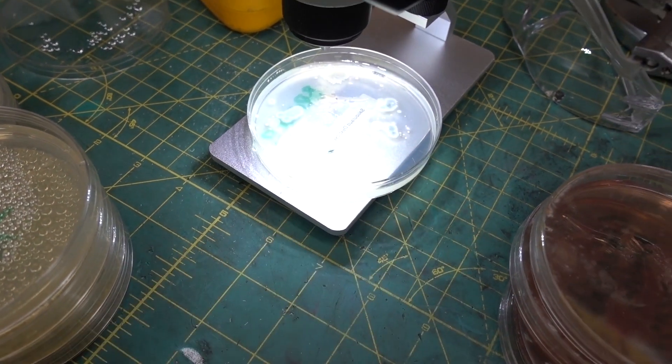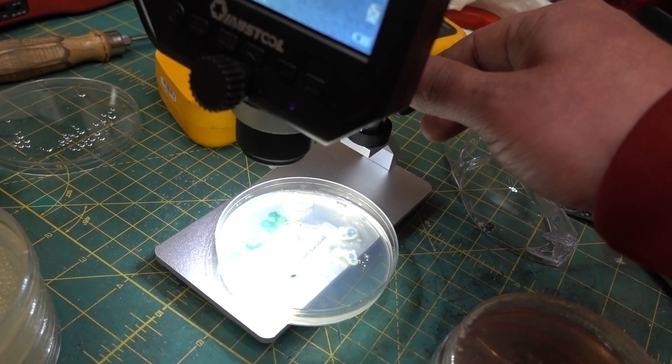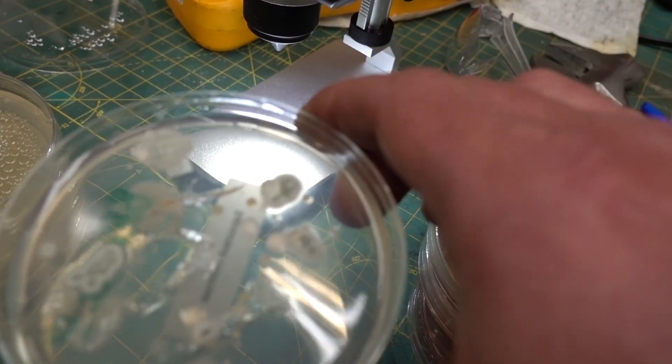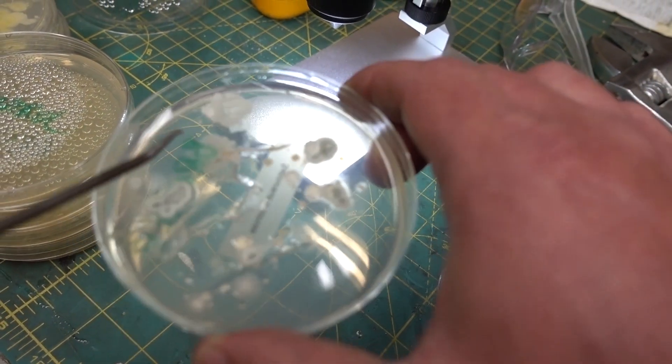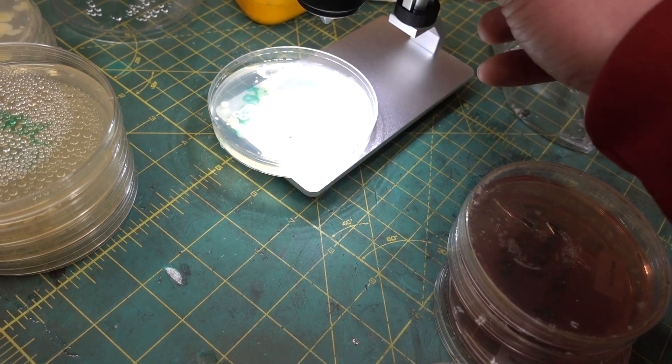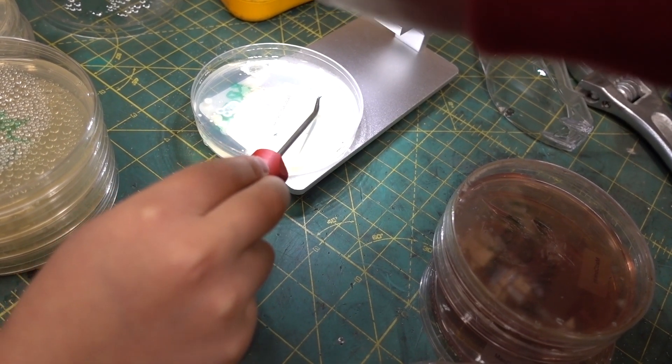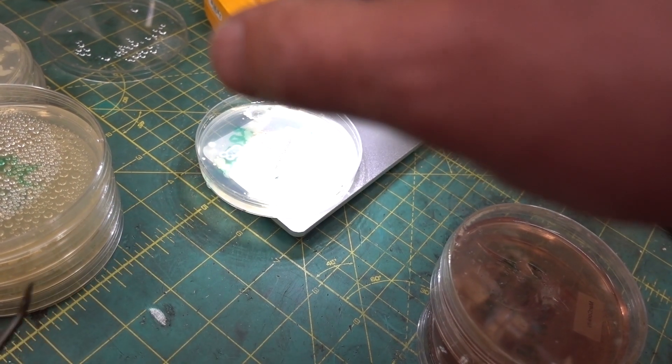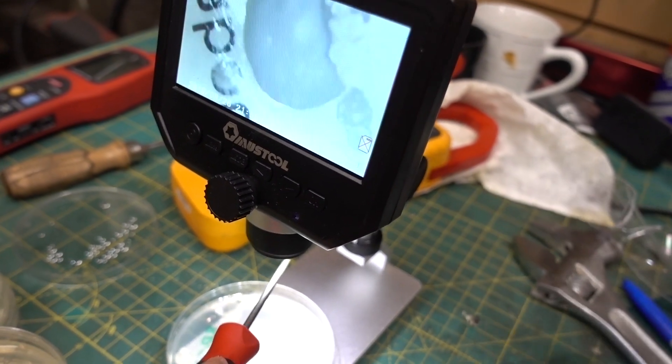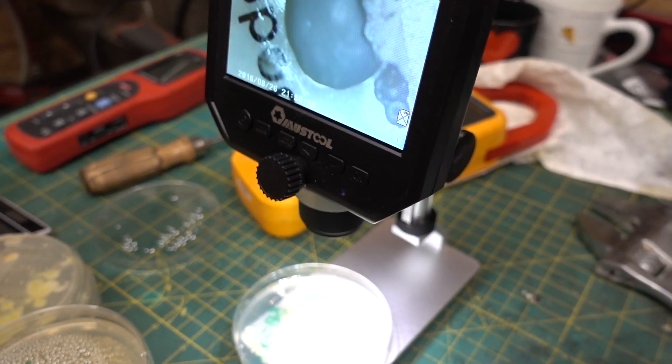And you can see, if we look at that in the microscope, you're going to see something that looks like a brain. Let's look at some samples under the microscope. What do we have in that dish? We have E. coli. Let's have a look at the E. coli. It's a white round blob. And then the furry one. What do you think the furry one is? Shigella. No. It is a fungus. A fungus amungus. Yeah. Probably penicillin. And can I touch it? Well, not with your hands, but with your O-ring pick, sure. Now look at that one. You just smashed it. So that is very likely E. coli.